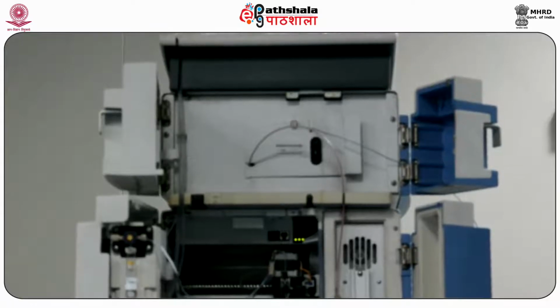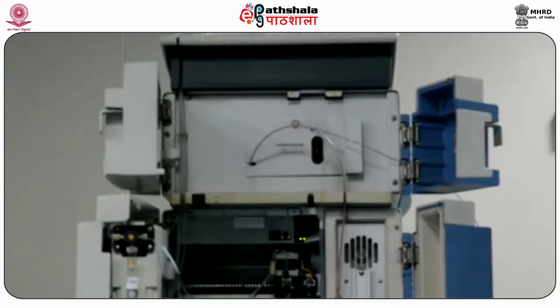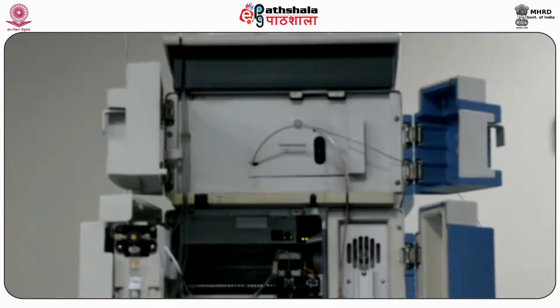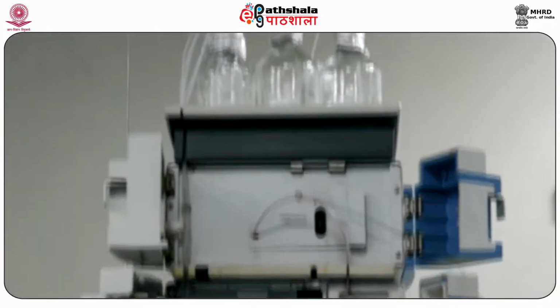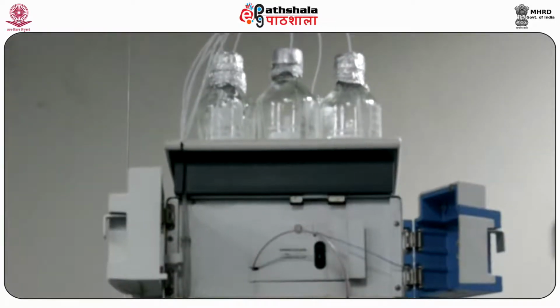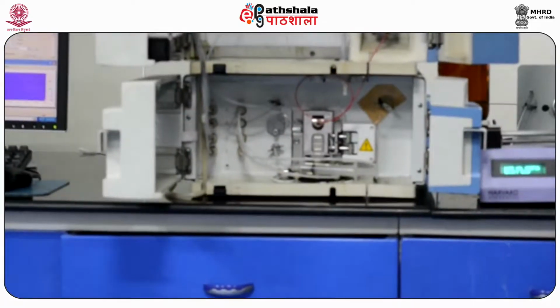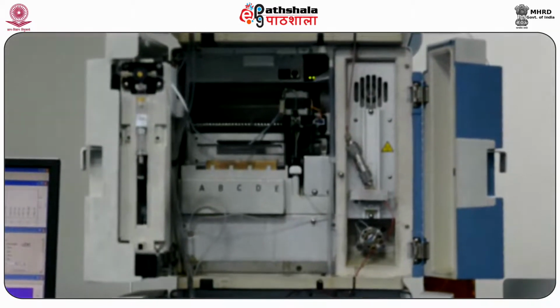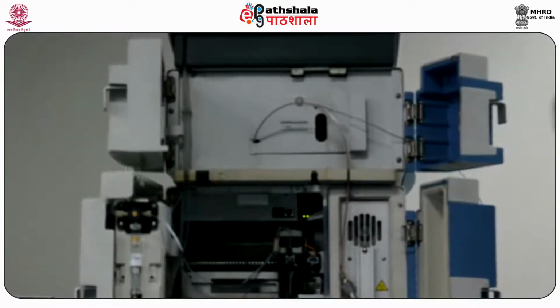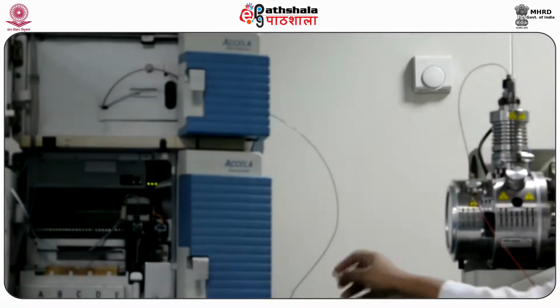Now it is set for a particular range, and from there the eluent goes into the mass analyzer. So here the HPLC works as a sample feeder for the mass analyzer, where it is fed into the ESI mass spectrometer. Above you see the reagent bottles. This is a quaternary pump, capable of handling four solvents together. It enables us to go for isocratic as well as gradient runs at different flow rates, from as little as 0.1 ml per minute, or even less, up to 2 ml per minute.